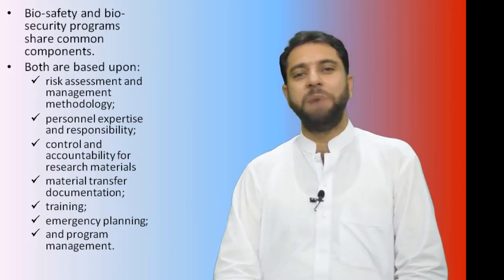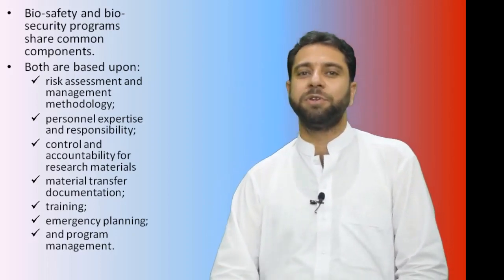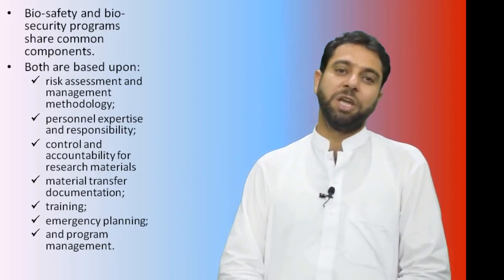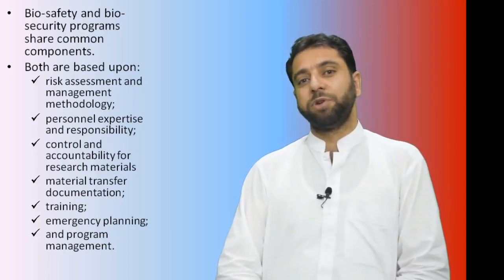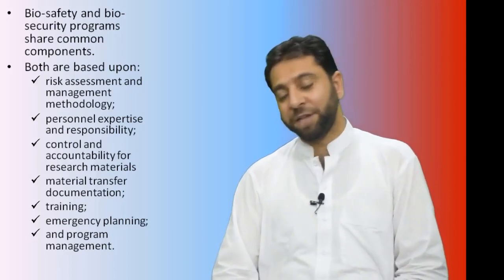Both the biosafety and biosecurity programs follow standard rules regarding material transfer documentation. Similarly, training is an important common component. Both the programs establish emergency planning and program management.